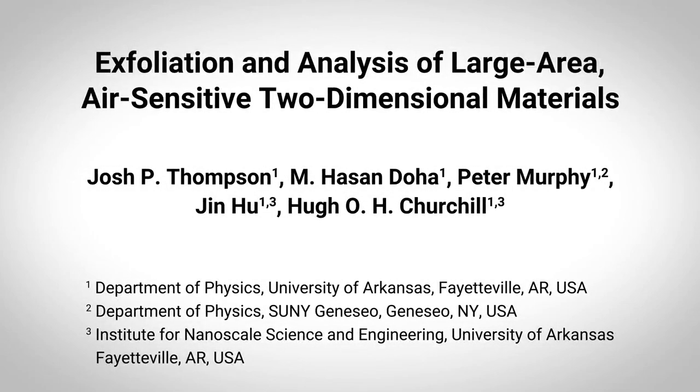This protocol demonstrates methods for exfoliating large thin flakes of air-sensitive two-dimensional materials and safely transporting them for analysis outside of a glove box.